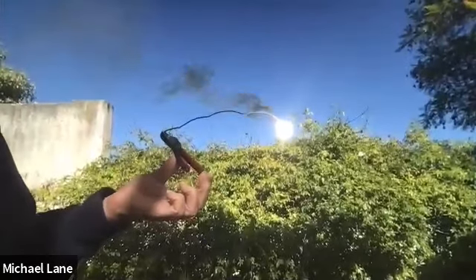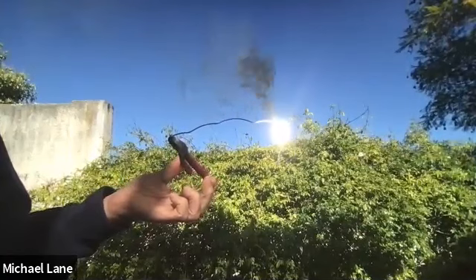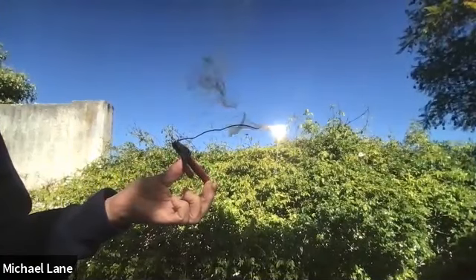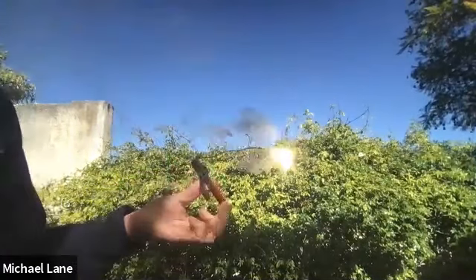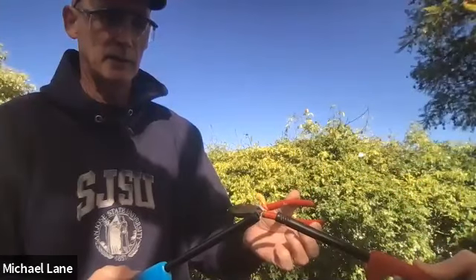You ought to be able to see that it is burning very, very bright, perhaps seeing a little bit of soot coming off. And so this is the reaction of magnesium metal. Pardon me, it's blowing in my direction. There we go. We'll get it going in the other direction. Oops, it went out. Let's go ahead and light that one more time, and see if we can get it lit again.